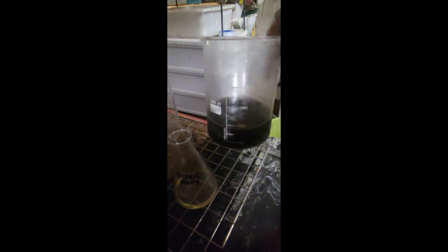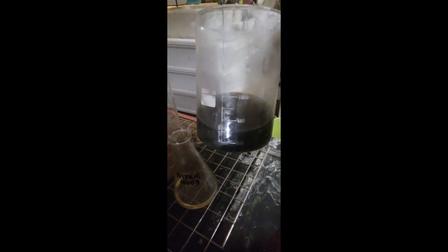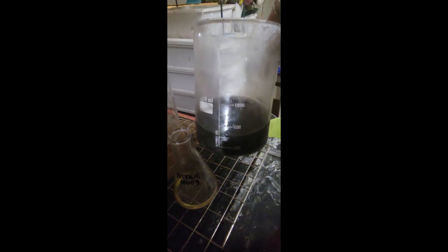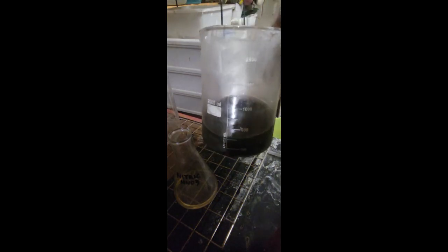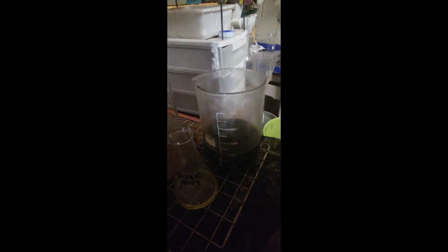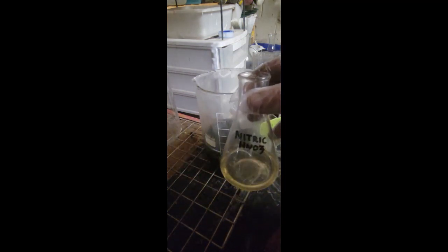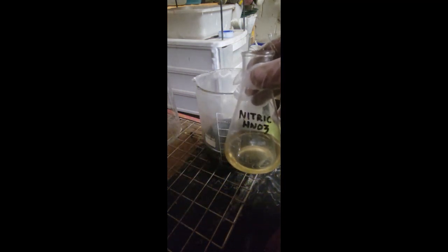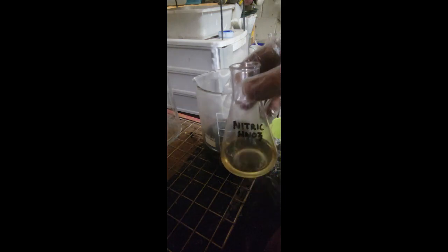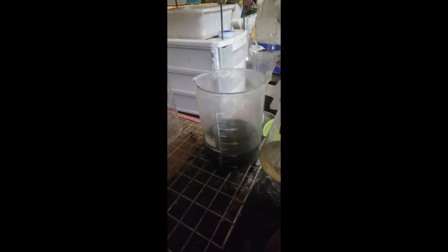So all those colors and everything that you once saw will now turn to literally dark black, okay? There's your silver. There's your moneymaker. That's everything that you worked for. Now, you don't even need to put this on heat, guys. All right? Here's nitric acid. I got roughly 100 milliliters, and you don't even really need to use that much. All right? In reality, even 50 milliliters would be more than enough to dissolve this.